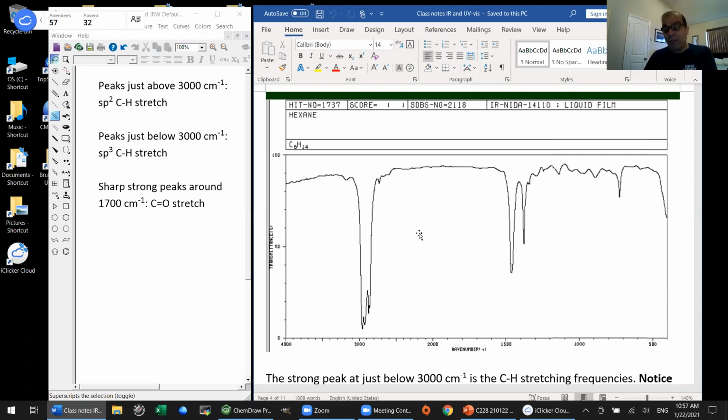Now, if we looked at the spectrum of toluene, which we well might in just a moment, I don't remember which aromatic compound we did, I think we'll be able to tell that there's an aromatic ring. And I think we'll be able to tell that there's both sp2 and sp3 hybridized carbons. That's also true. But picking it out exactly, I don't think is possible. Good, so this is a pretty boring spectrum, but any other questions just on this one before we start actually adding functional groups?